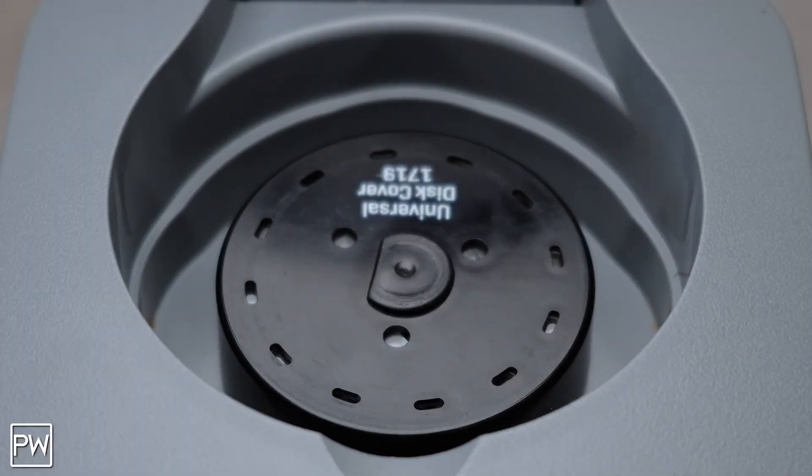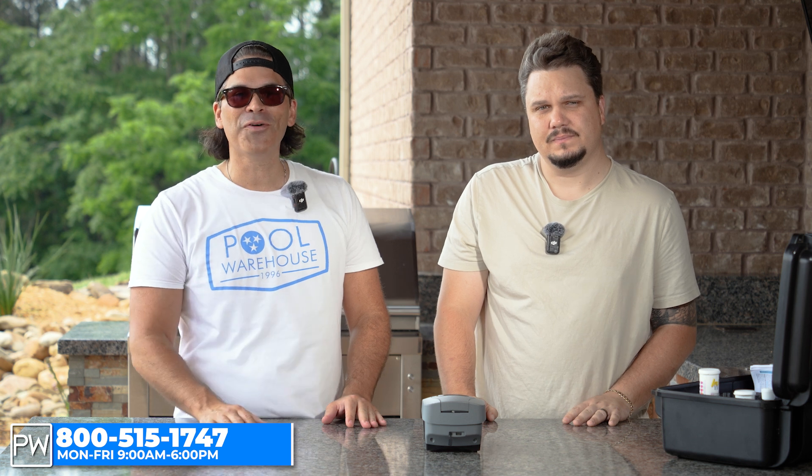As a homeowner, you may not be super experienced doing water tests — it may be something brand new to you. This makes it really easy. I do love it, and it is probably the best unit on the market that I've found for testing your water at home. If you have questions about this unit, feel free to give us a call Monday through Friday, or you can always visit us online 24/7 at poolwarehouse.com.